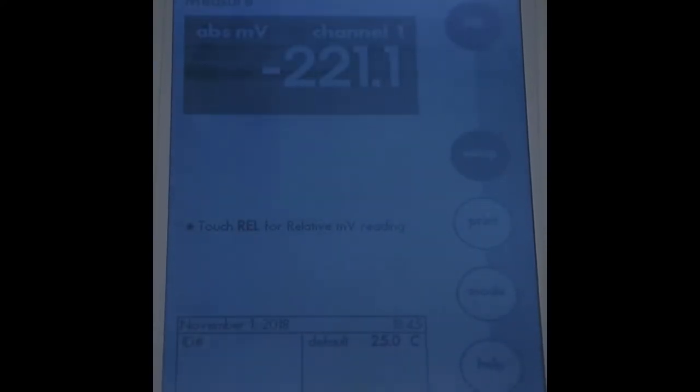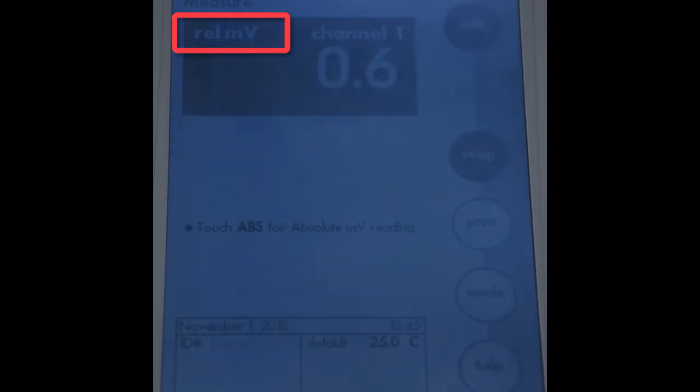Change the readout on the meter to the millivolt setting by pressing the absolute button. Make sure the readout displays ABS or absolute for absolute measurements and the millivolt unit is visible.